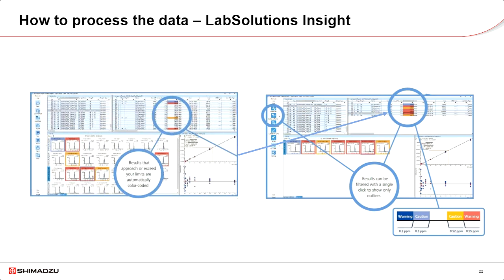You learn about the flags that can be built in LabSolutions Insight. And now let's learn a little bit more about how we can do that. Very important when you are validating your methods and you are running samples in support of the PFAS regulation.